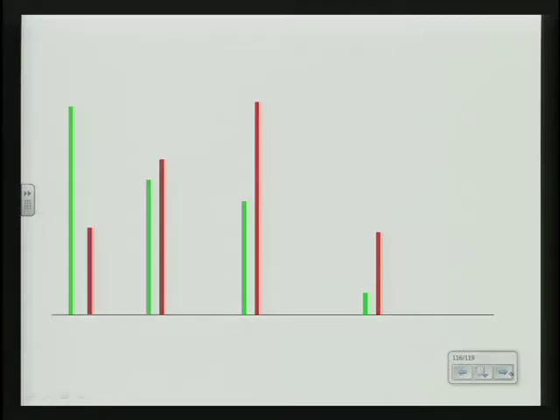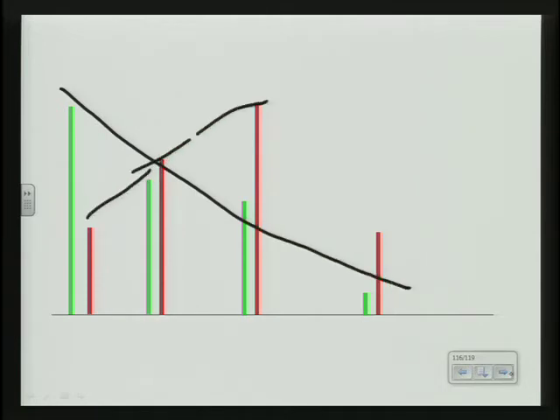So again, going to this channel, same type of thing. You've got the major component kind of degrading. You've got the minor component. Pretty much at the next locus, it's almost a 1-to-1, and then it goes downhill from there. So the minor component's taking over.